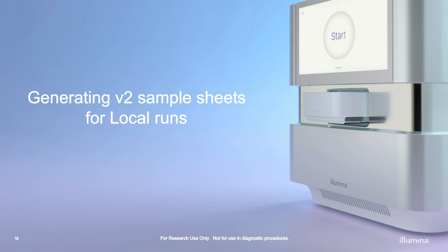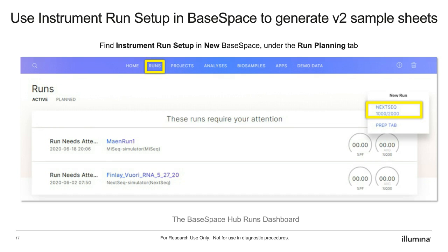All right, so now that we are aware of the different run modes, and how analysis starts locally, in the cloud, and using a standalone server, let's talk about generating V2 sample sheets for local analysis. We recommend using the instrument run setup in BaseSpace to generate V2 sample sheets. To access the BaseSpace instrument run setup, your BaseSpace account must be toggled to new BaseSpace mode. Once you're on the dashboard, you're going to click on Runs, then New Run, and then select the NextSeq 1000/2000.